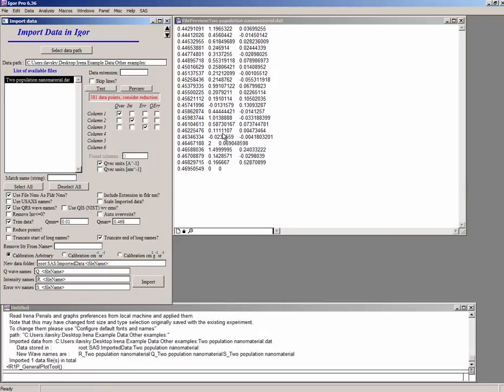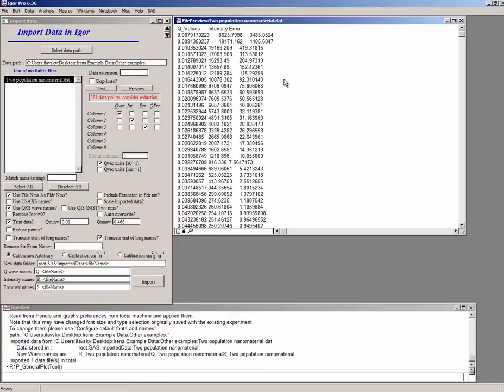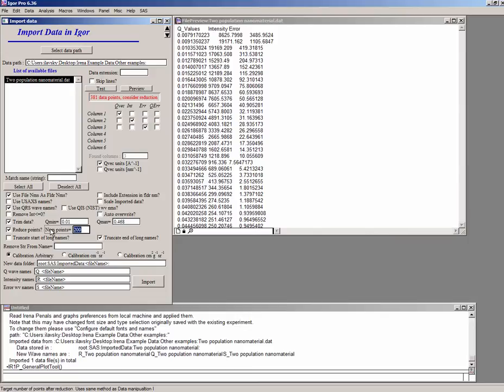The other thing is, notice there is this big red thing, which says you have found so many points. Do you want to reduce that? I would go in and say, yes, let's reduce the points. It will do a log reduce of the points. And what we can do is we can reduce the number of points like 120.